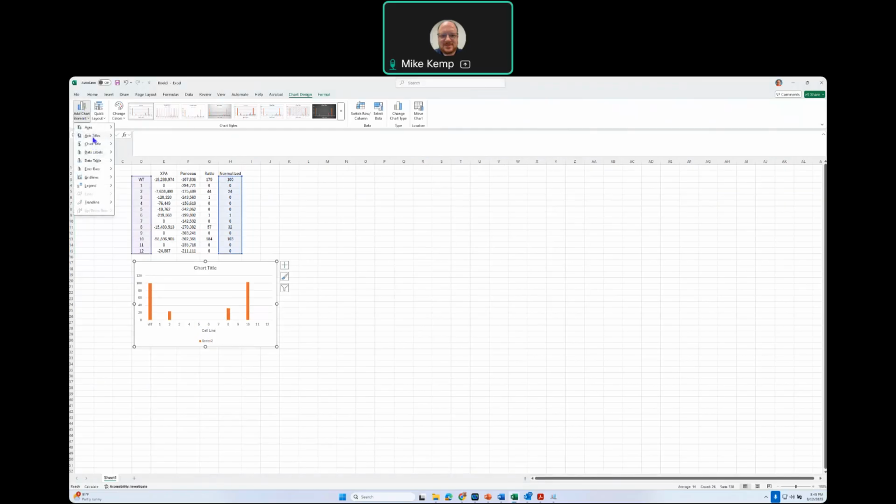So we go under add chart elements. You can do x title, x or y. Vertical is, let's just say, relative XPA protein. And that, again, is not totally descriptive, because relative to what? So in a figure legend, you'd say all of the samples are normalized to the wild type cell line, for example.